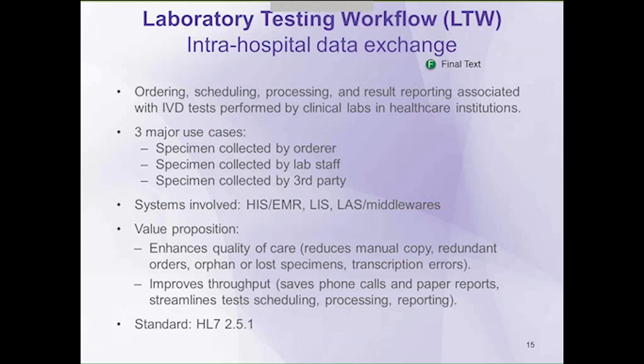So to get to the detailed profiles, the first profile I want to introduce to you is the laboratory testing workflow. This is probably the most commonly understood lab use case. It's specimens collected by the person that orders the test, specimens collected at the lab, or specimens collected at a third-party collection site. These are transactions involving an EHR system and an LIS system and potentially any middlewares.